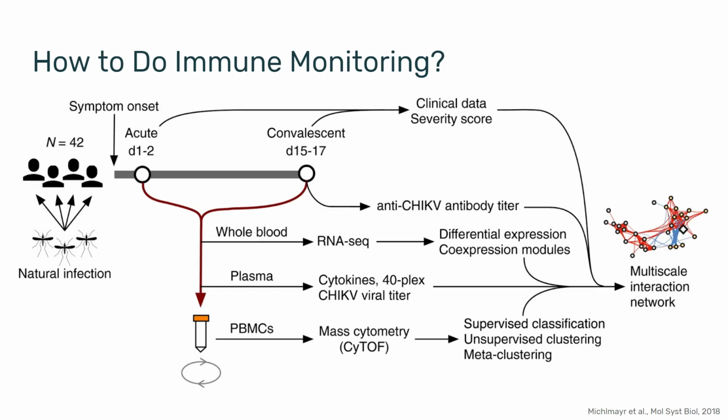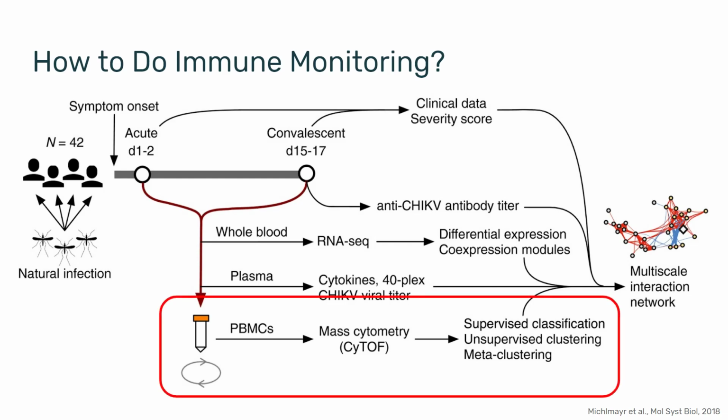I also mentioned that under the umbrella of immune monitoring, we can find multiple different technologies, such as single-cell RNA sequencing, ELISA, ELISpot, Luminex, and flow and mass cytometry. For the context of these videos, I'm going to focus on these latter two technologies. Flow and mass cytometries are sister technologies, and while they do differ in their chemistry and in their physics, the end result is quite similar. So I feel that we can confidently bundle them under one term, just for the context of these discussions.